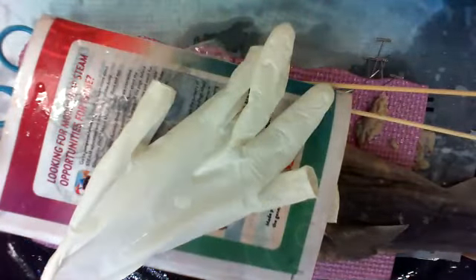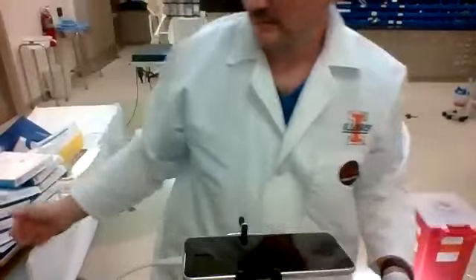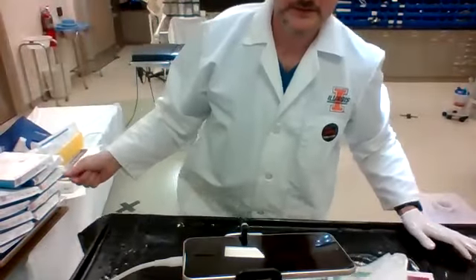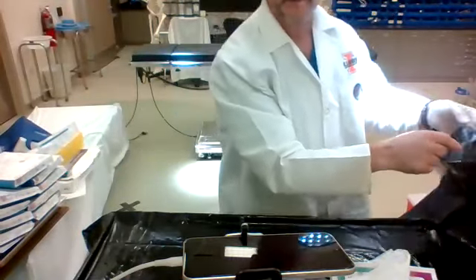Okay. I'm going to switch cameras so I can show you how I'm doing this. And again, you don't have to do this right now if you want to keep dissecting. That's completely up to you. But we dissected what we needed to. So I'm going to point this down a bit. I'm going to roll this out. So my seam is over here. You can see the seam. That's the bottom of the bag.